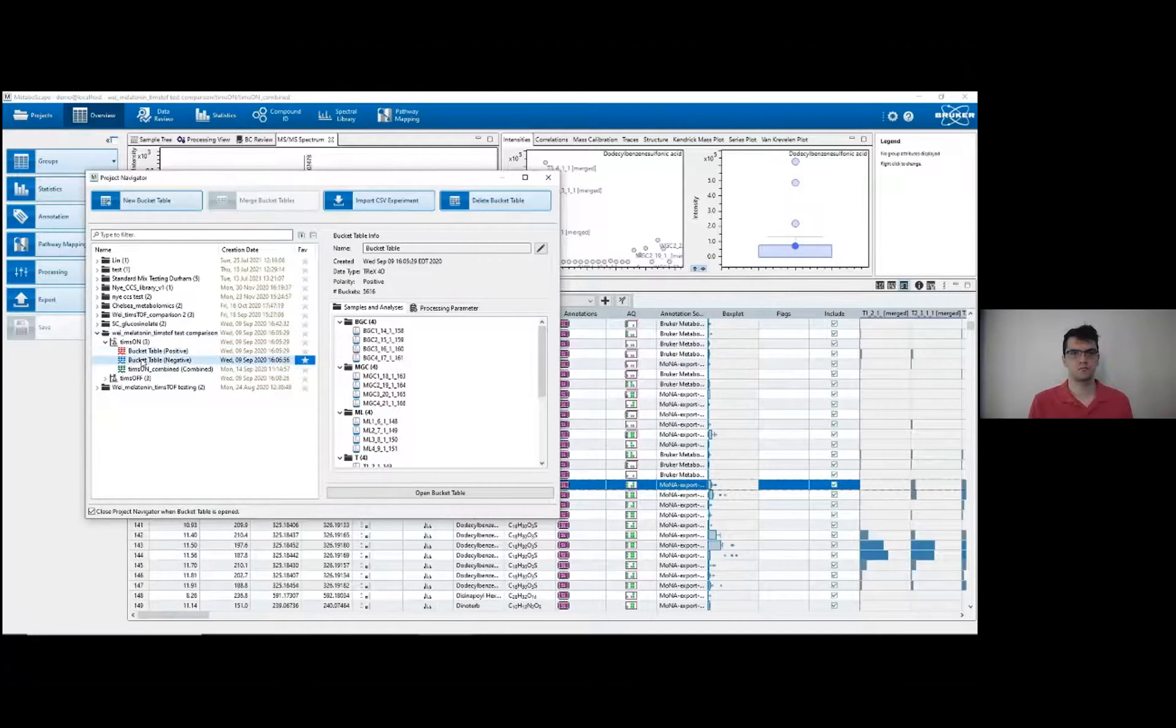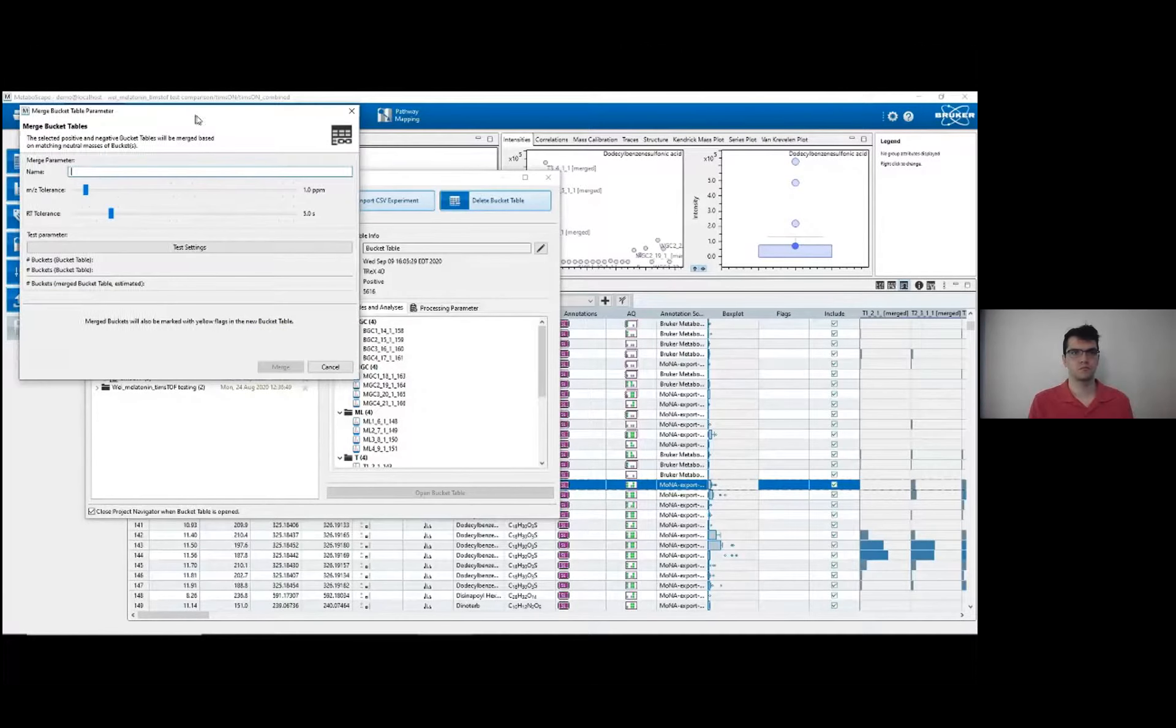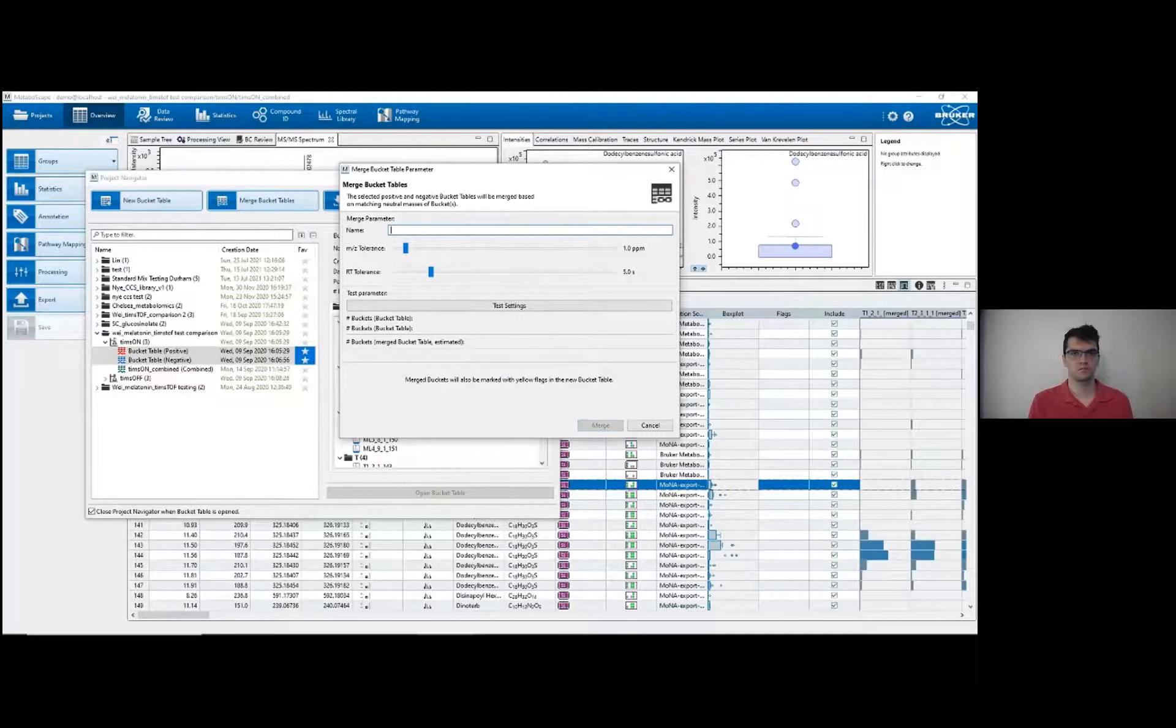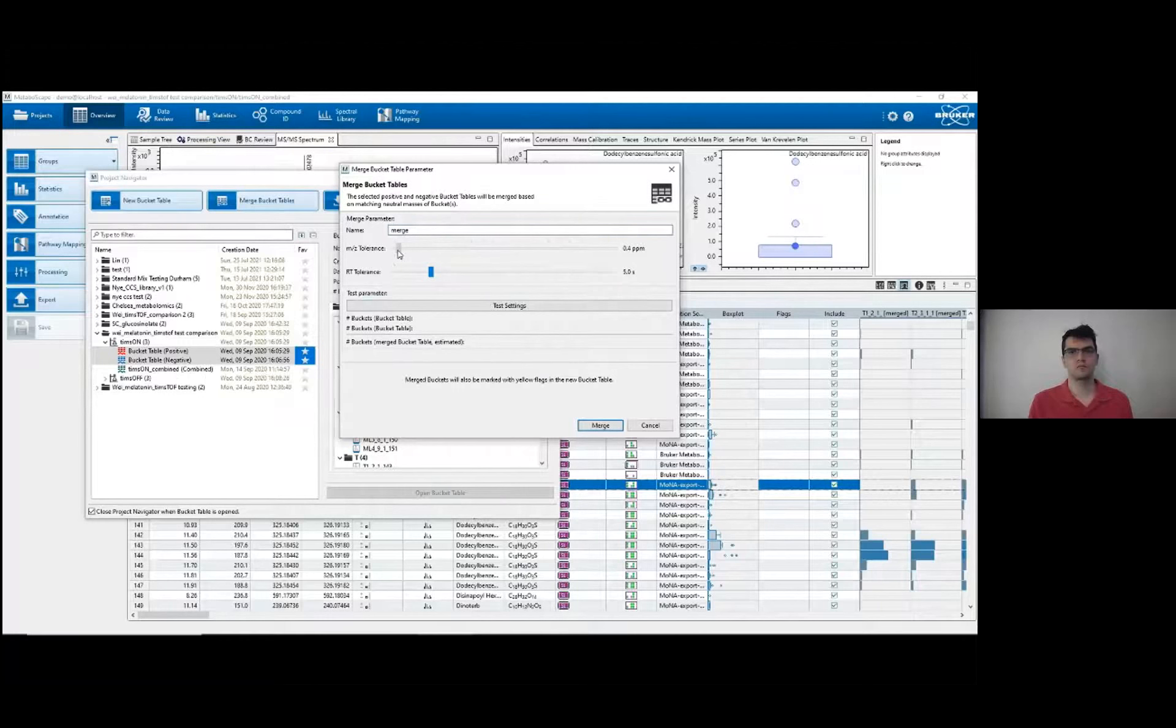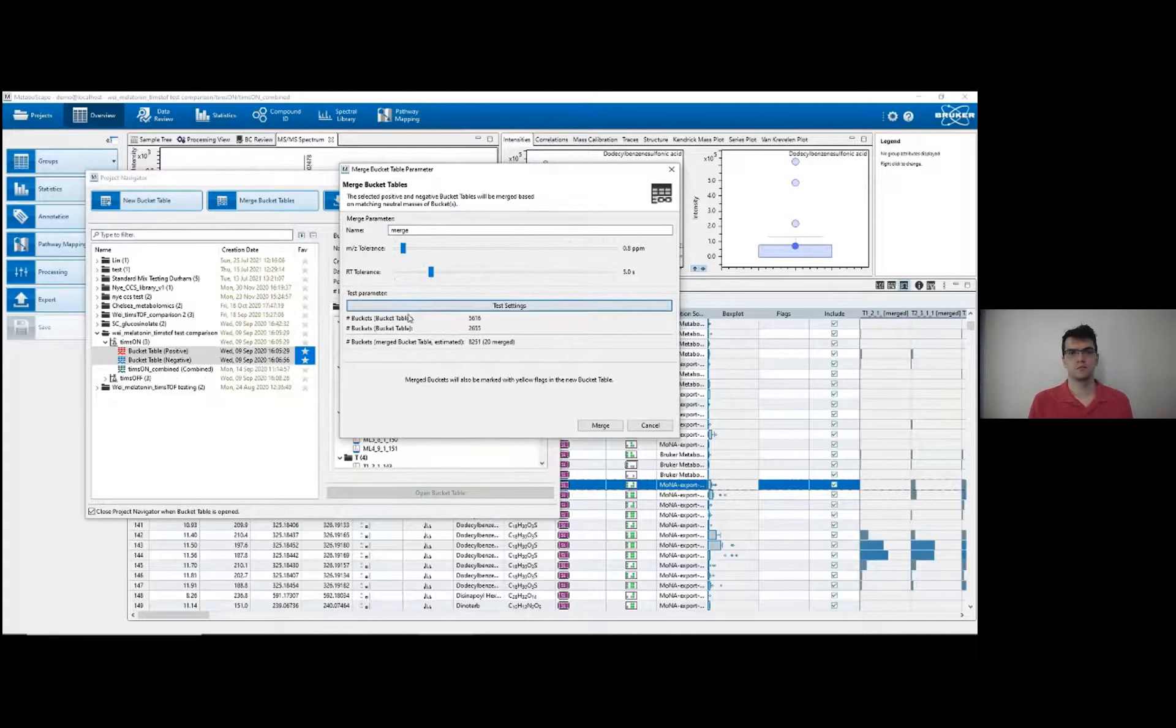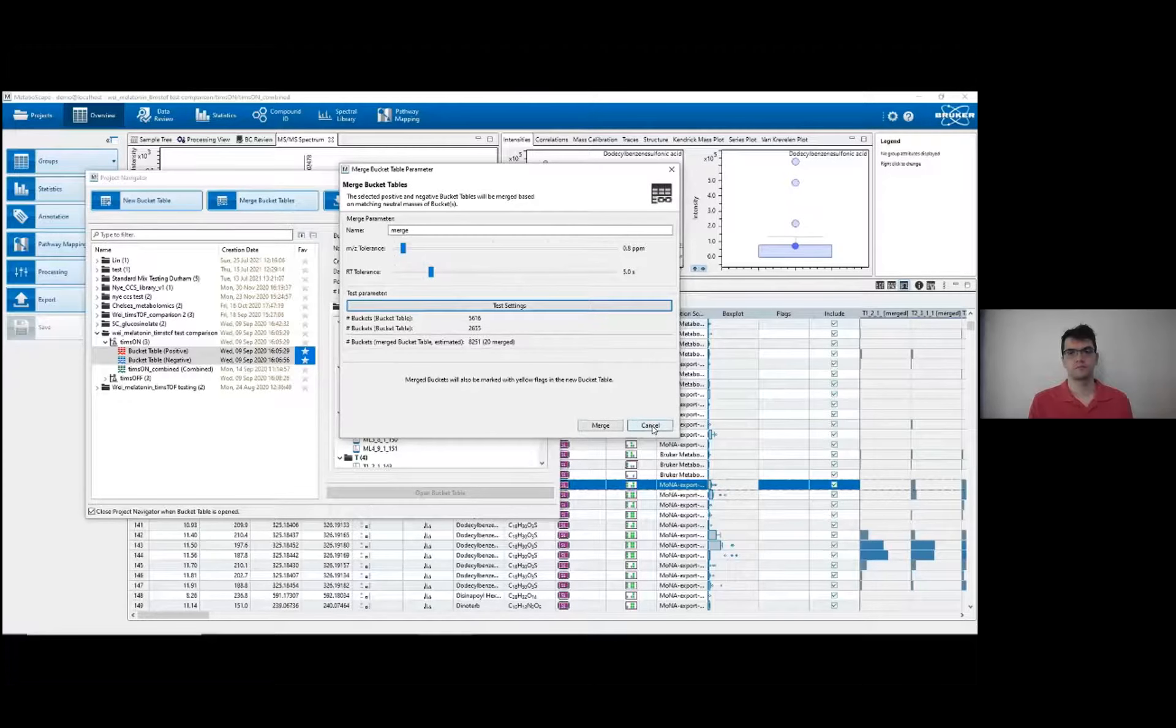I would then have positive and negative bucket tables here. I could right-click both and merge them, and then these merged tables combine both positive and negative into one bucket table to do data analysis, statistics, annotation, all of that. You can set tolerance ranges here. I usually leave them pretty low though. You can test the settings to see how many buckets would be combined, and generally not very many in my experience. Of 8,251 here, only 20 would be merged. Already done that though, so I'll hit cancel.